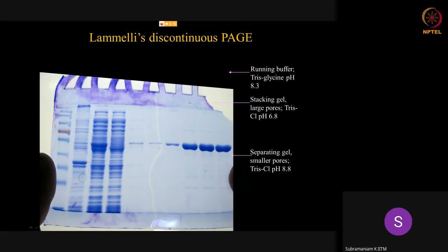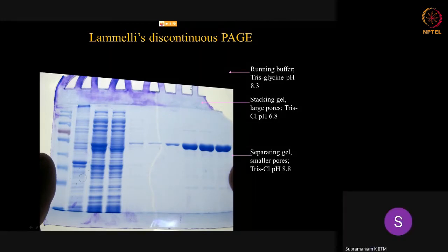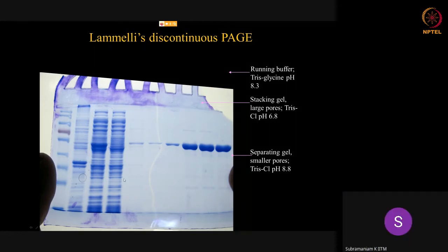Now when the protein solution migrates, it will be a 1 centimeter column that is migrating. So a given molecular weight protein is present all through this 1 centimeter column. Every band will be exactly the same height as the original column of liquid that was there. Due to that, you are not going to get fine sharp bands like this. Look at that. This well was filled, but this protein is only a sharp band. If it is going to be wider like the original size, then the next ones will all overlap and separation will not be good. This limitation is primarily because you are making a thin gel between two glass plates, and that is because you want to prevent exposure to air.